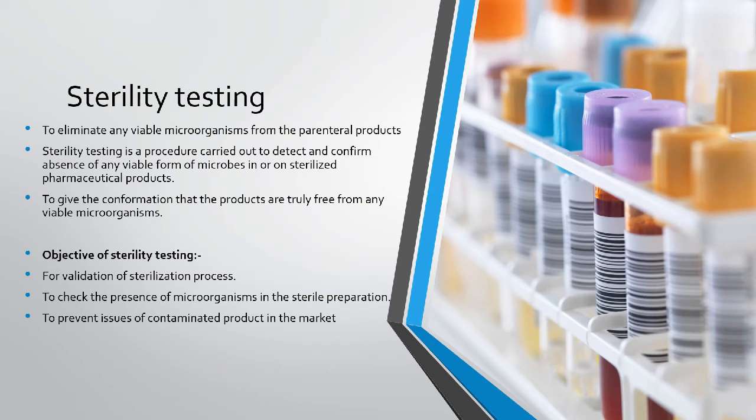So for the next slide, I'll be presenting about sterility testing. The main point of sterility testing is to eliminate any viable microorganism from the parenteral products. Sterility testing must be conducted. Sterility testing is a procedure carried out to detect and confirm the absence of any viable form of microbes in or on sterilized pharmaceutical products. It gives the confirmation that the products are truly free from any viable microorganism. The objective of sterility testing is validation of the sterilization process, to check the presence of microorganisms in the sterile preparation, and to prevent issues of contaminated product in the market.